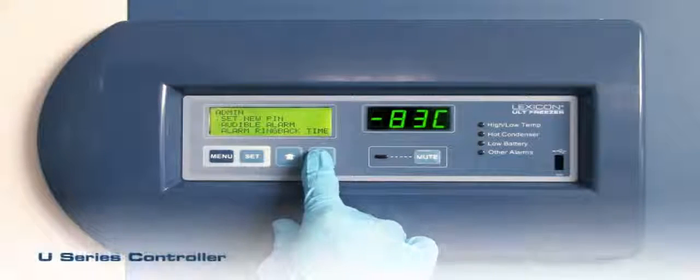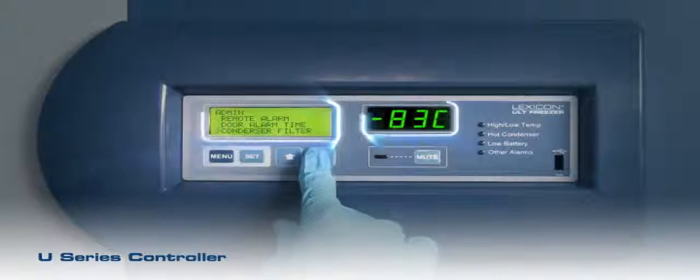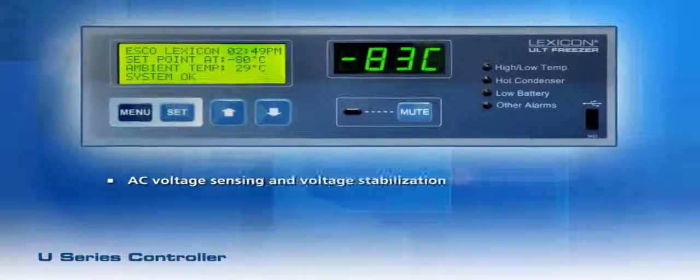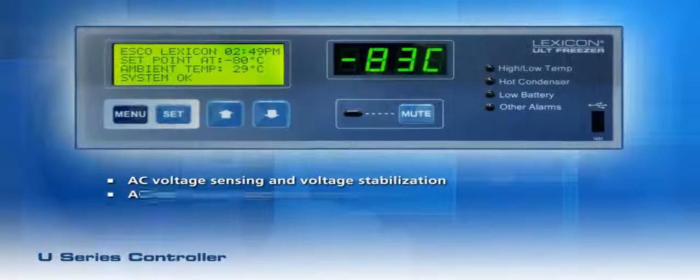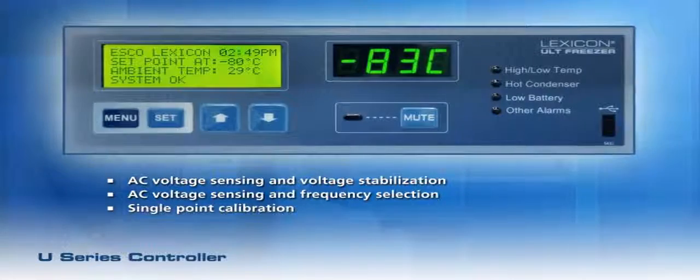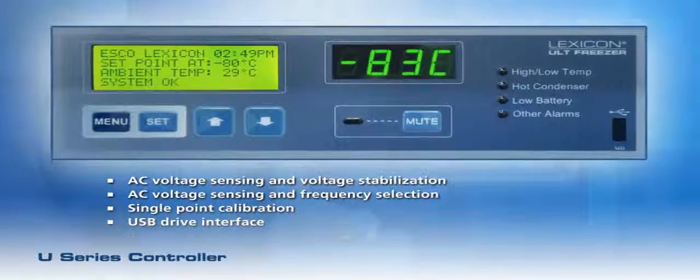U-series controller provides a more user-friendly function using a dual LCD LED display. U-series controller offers new features including AC voltage sensing and voltage stabilization, AC voltage and frequency selection, single point calibration and USB drive interface to download data from flash memory.